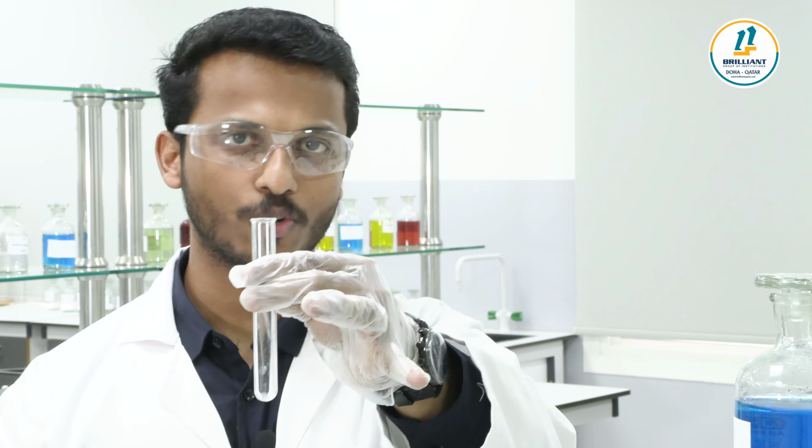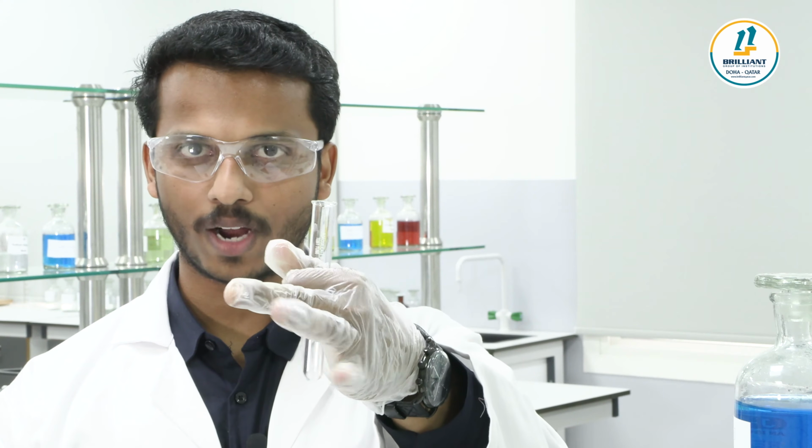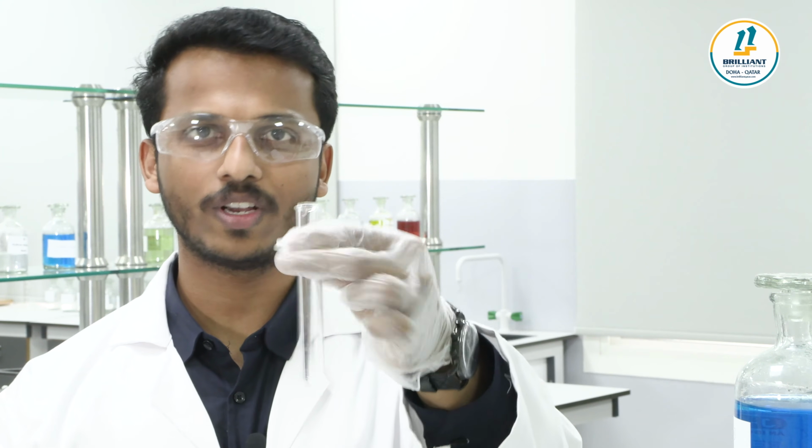Let's start with anion analysis. First I am going to do the preliminary and confirmatory tests for the carbonate anion. First, the preliminary test for carbonate. I am taking a test tube. Please don't hold the test tube like this. The reactions happen in the bottom part, so you have to see that. Hold the test tube like this. Two fingers are enough.